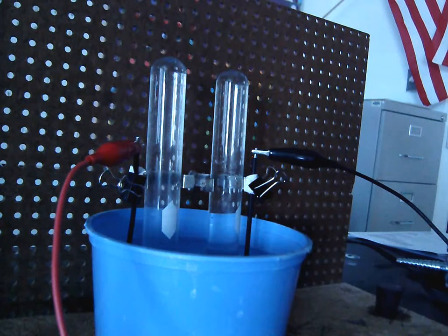What we're going to be doing in this lab is a method called electrolysis. Now, at the end of the day, the process itself is not what we're trying to get at. That's not our end goal. The end goal in this particular lab is to figure out, when I take water and decompose it into its individual elements, how much of that water is hydrogen and how much of that water is oxygen. So we're going to be looking at ratios. We're going to figure out the volume ratio of hydrogen to oxygen and the mass ratio of hydrogen to oxygen in a sample of water.